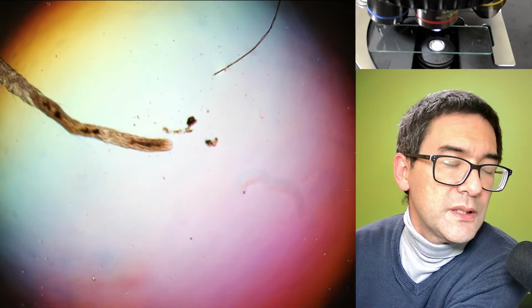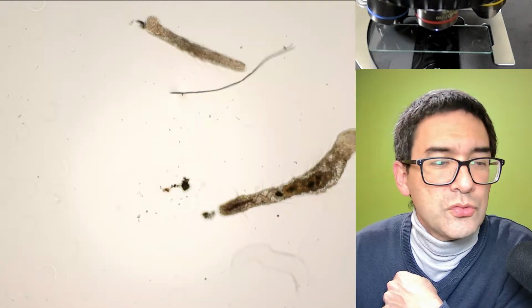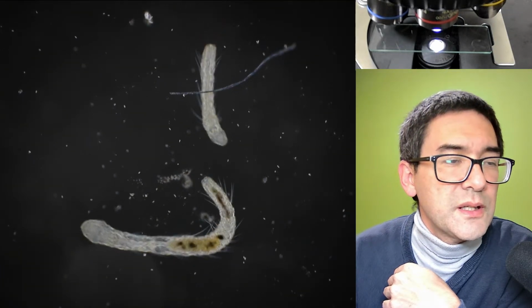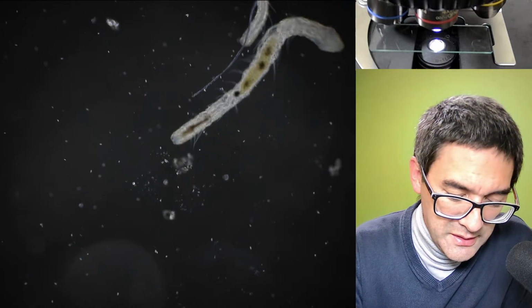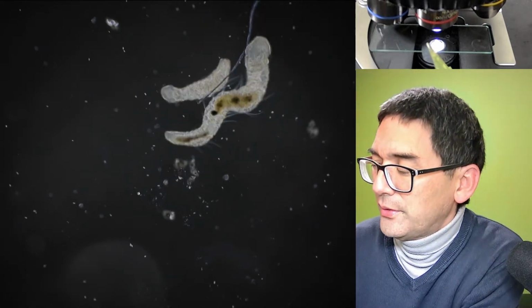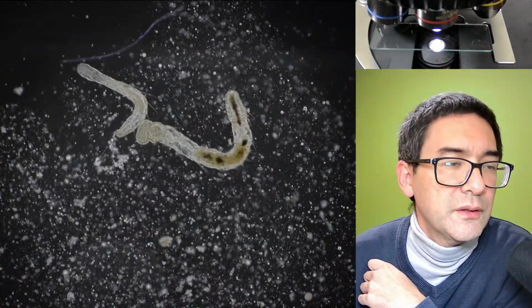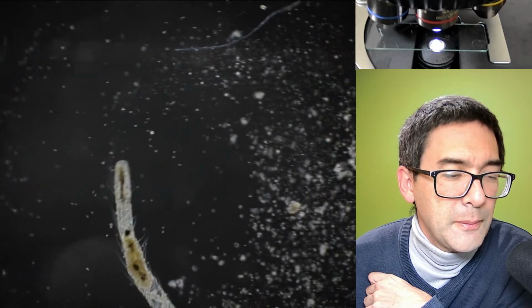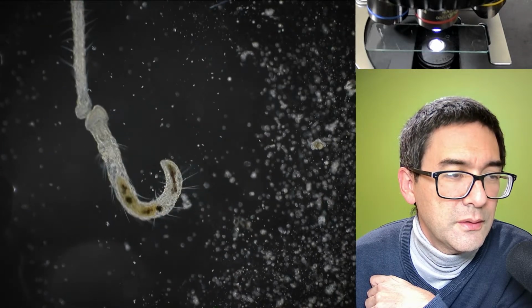So let's have a look here. Let's remove this here as well. So we're just in regular bright field again. You know what? Why not try? Okay, I think I kind of like this as well. This dark field looks nice. Okay, so let's try to add again a little bit of this spicy substance. So 3, 2, 1, and one drop. Now we can see quite clearly the particles of the chip. Let's see if it turns away.